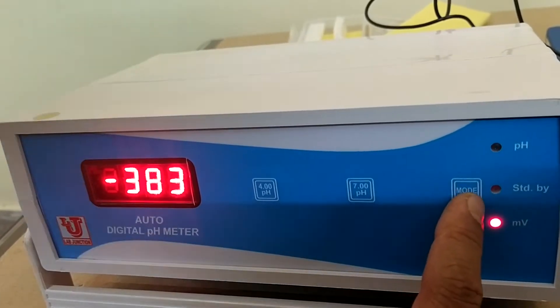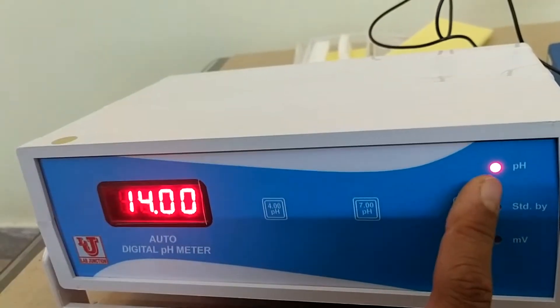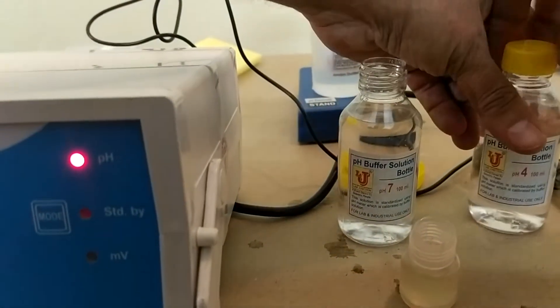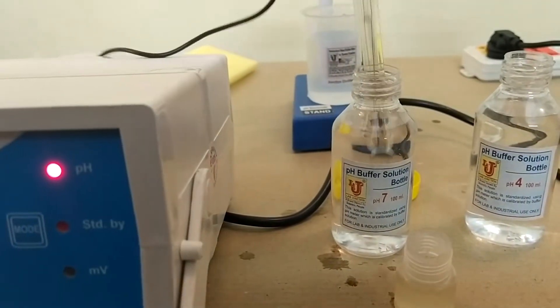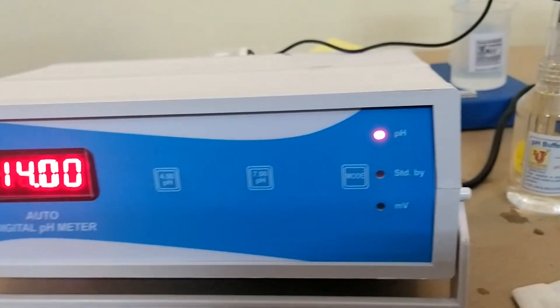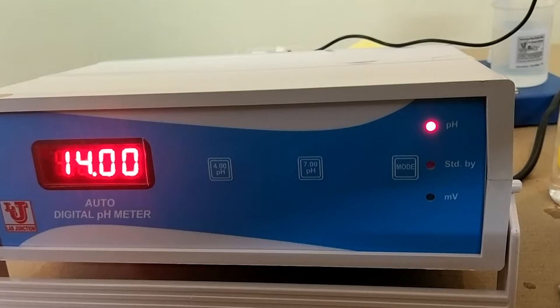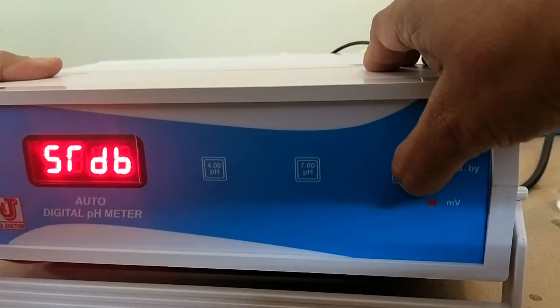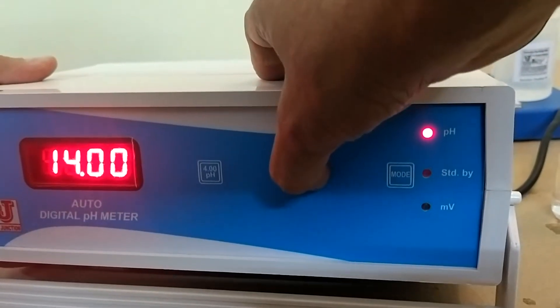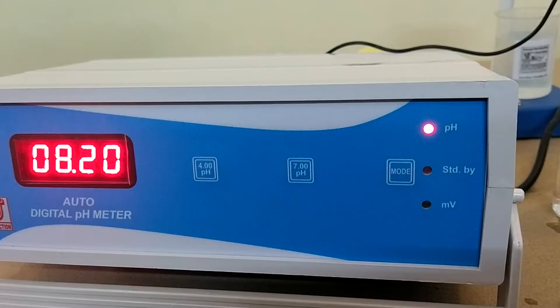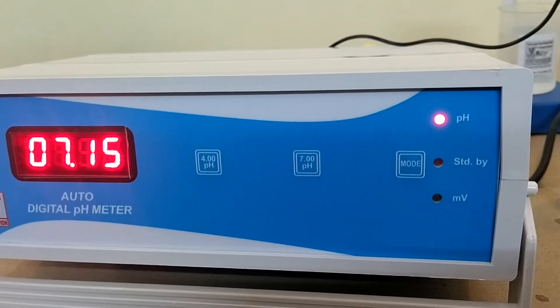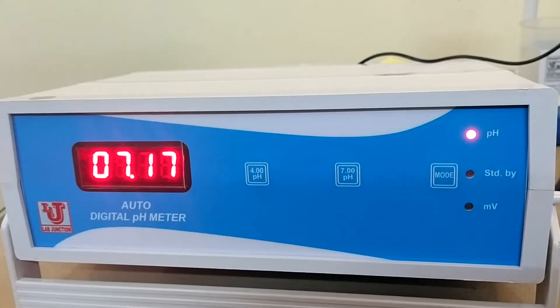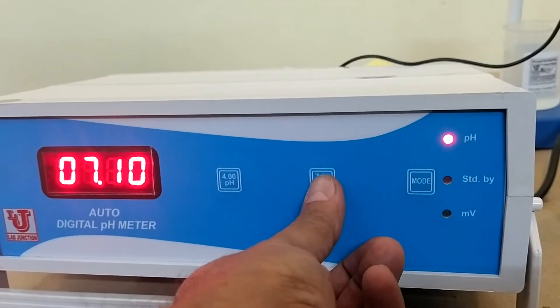Now how to calibrate this. Put the switch on pH and dip the electrode in 7 pH like this. And press 7 for this. Suppose you got 7.17, again press 7 pH.